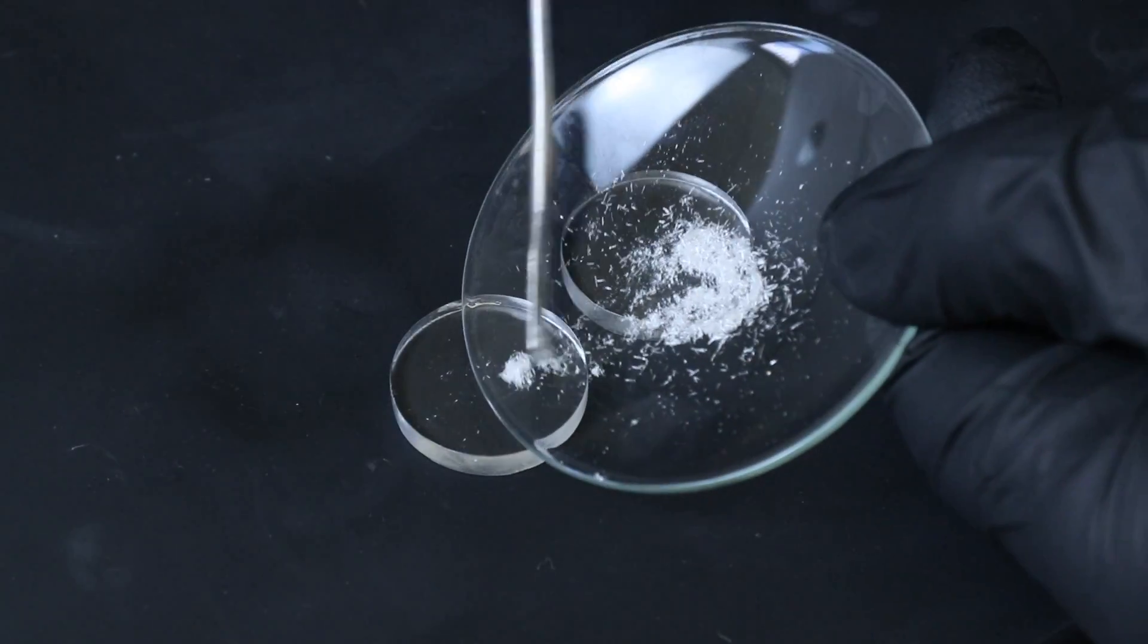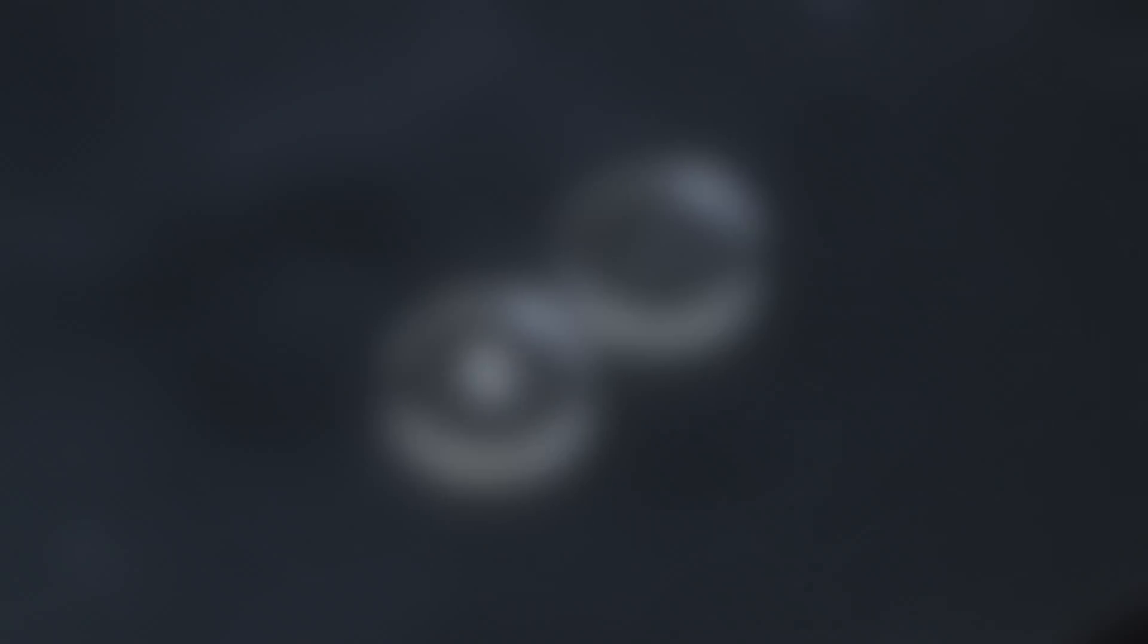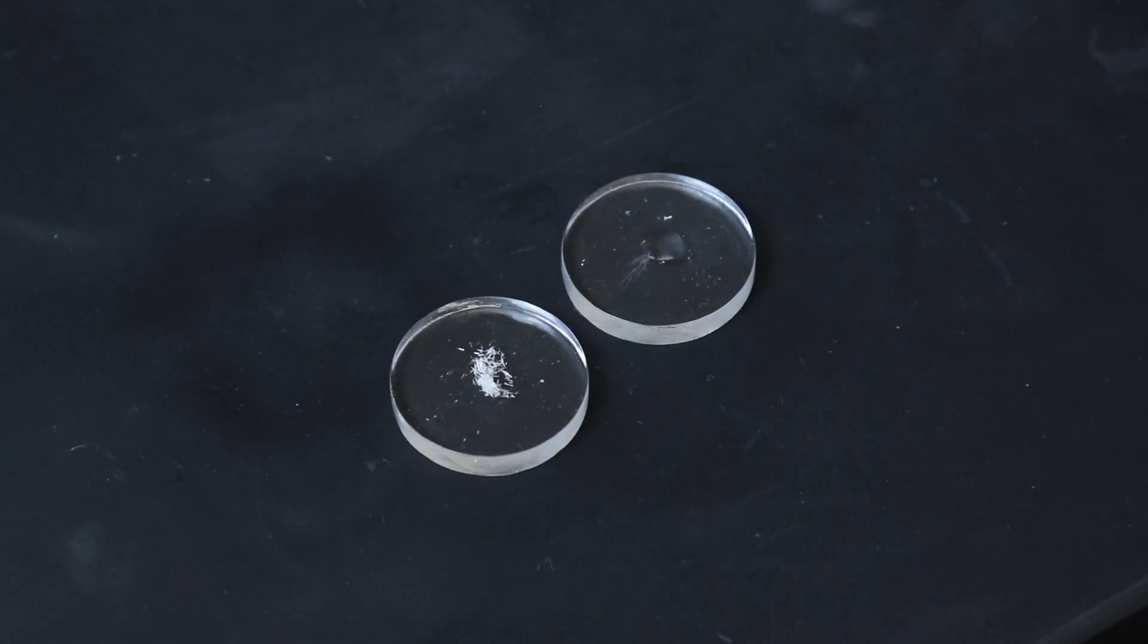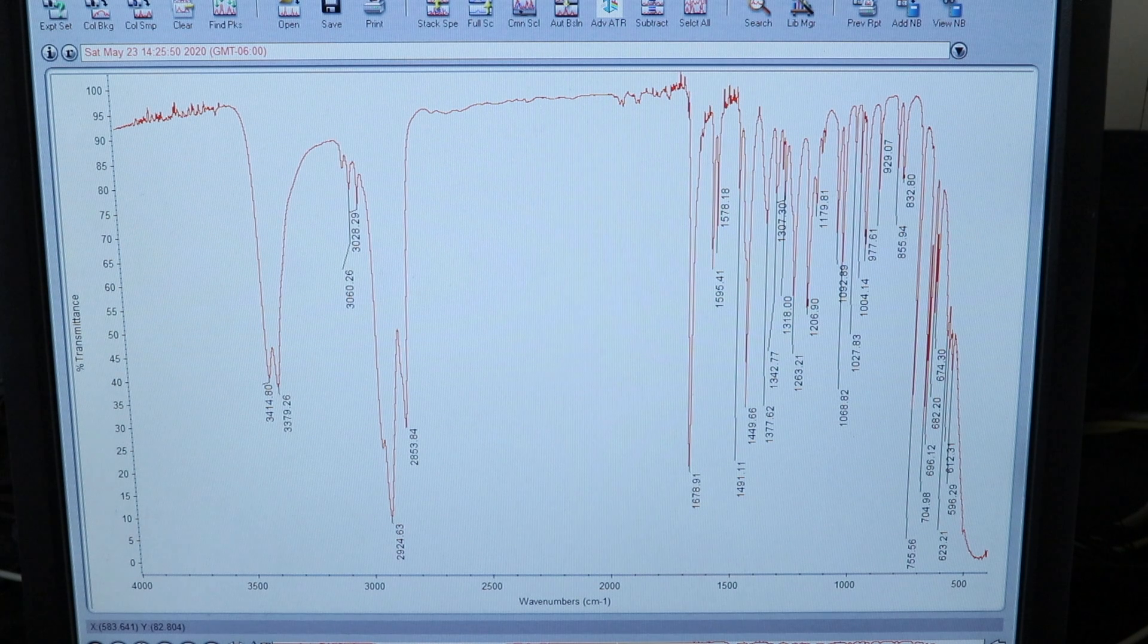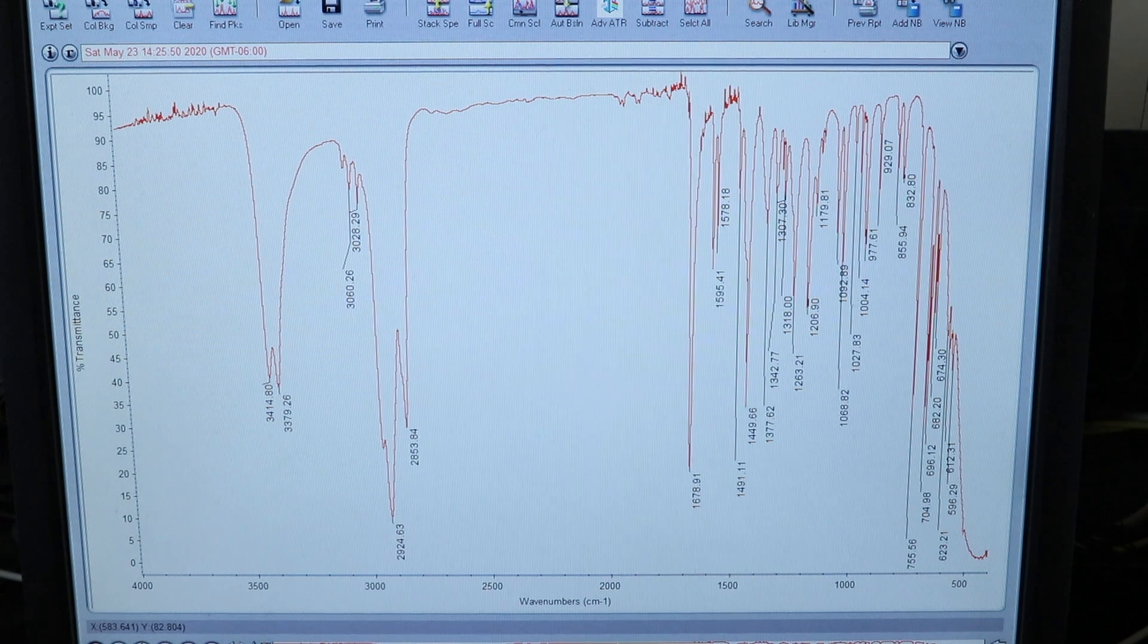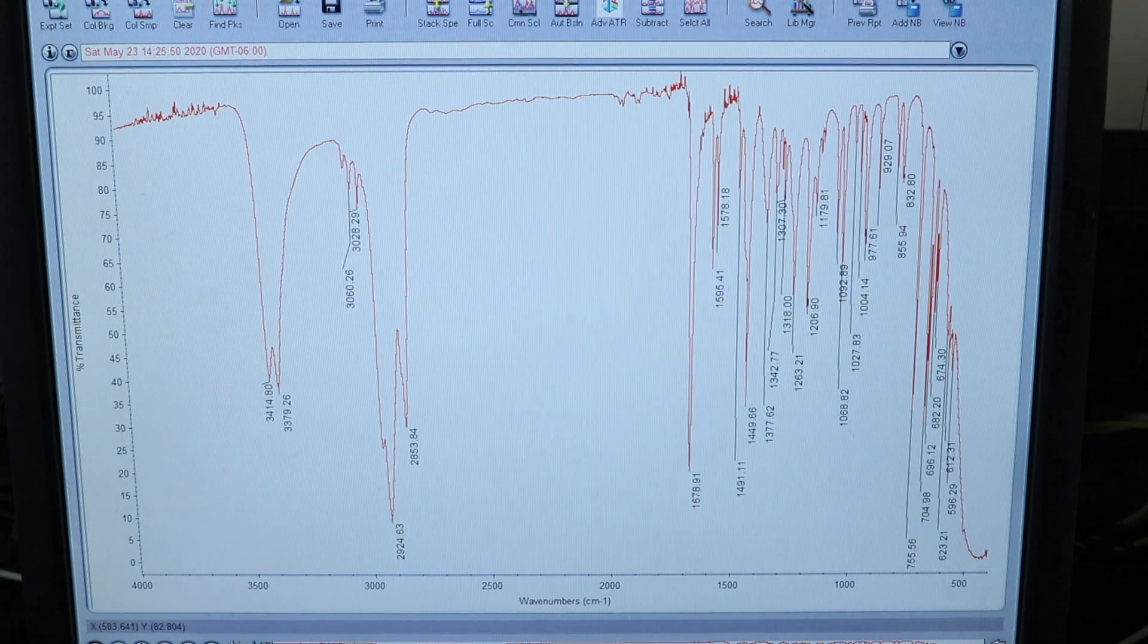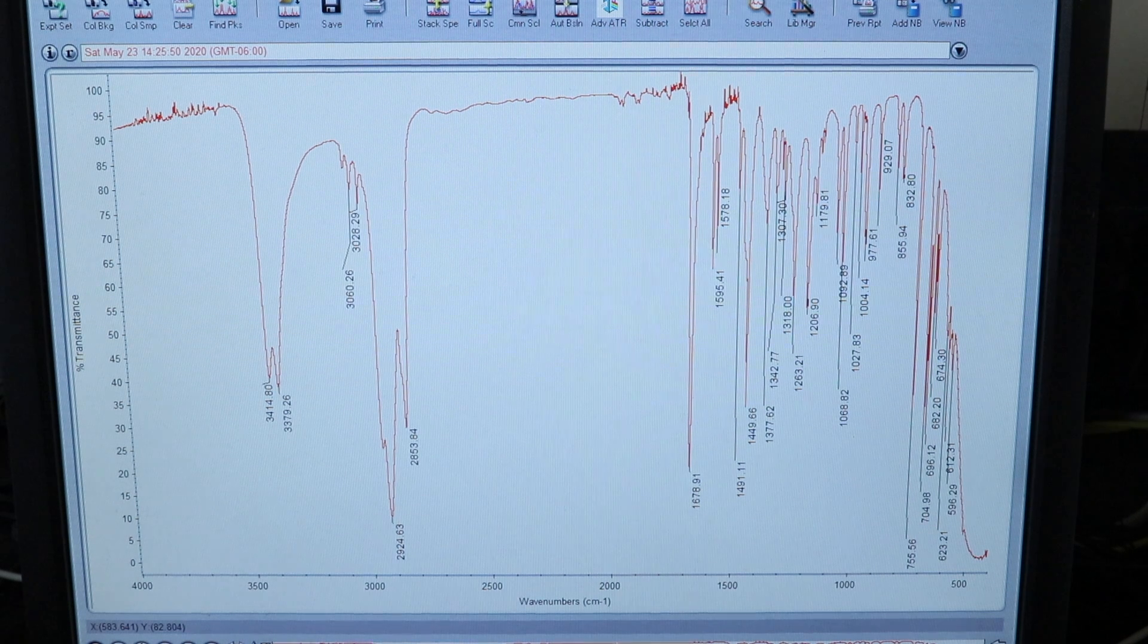Finally I'll run an IR spec using the neutral mold technique and that turned out great we can see a clear OH peak and then a carbonyl peak around 1678 plus some aromatic overtones so that looks pretty good.